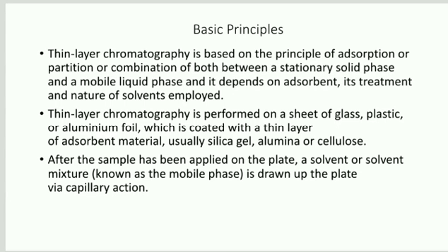After the sample has been applied on the plate, a solvent or solvent mixture known as the mobile phase is drawn up the plate via capillary action.